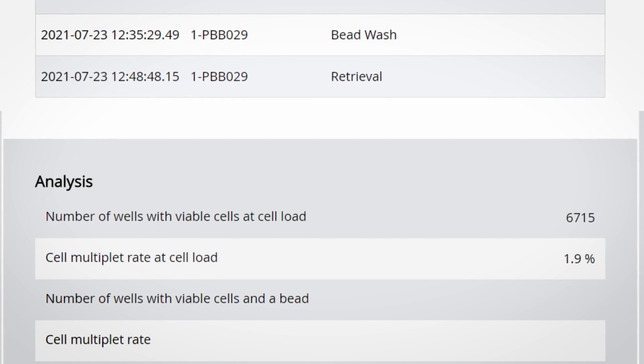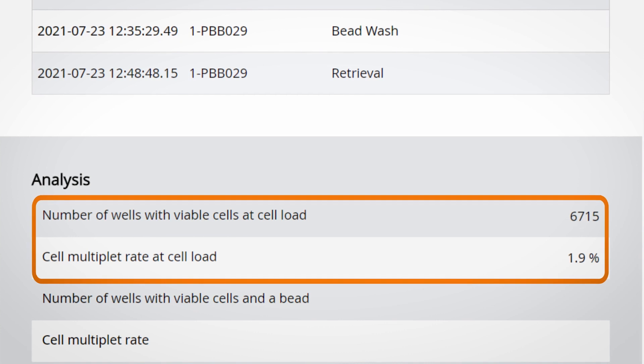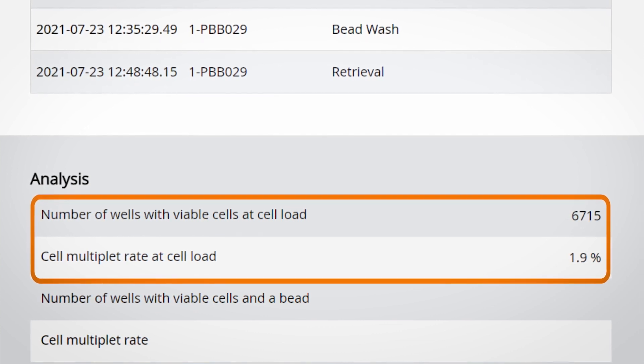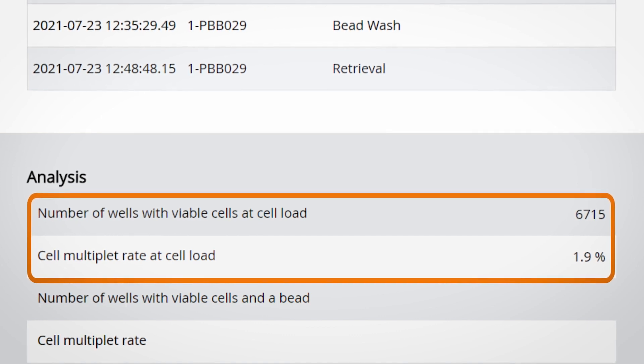For this experiment, we loaded 7000 cells and captured 6715 with a multiplet rate of 1.9%, which is slightly higher than our expectation, but not unreasonable.